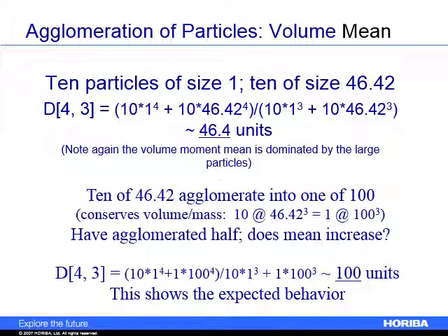So you really need to make sure that you understand this concept: how you do particle size measurement, how you prepare your sample, how you compare it to other techniques, how you do your math, and how you report your statistics. All of this is really important in giving you the information that you need to make the decisions you make as a material science engineer.